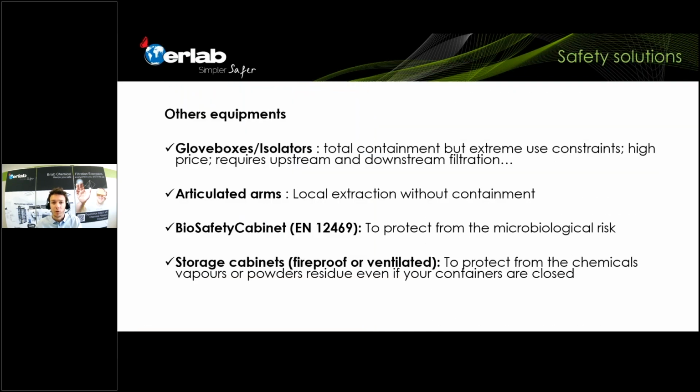Of course, what we saw again in the list of safety solutions, these are some other solutions that are used in labs: glove boxes, isolators, articulated arms. For people who use those in the lab, it's important that you know that articulated arms have no containment. There is an extraction to the outside air, but there is no containment, which is really important for you to know. Maybe it's an interesting idea to then look for a better solution.